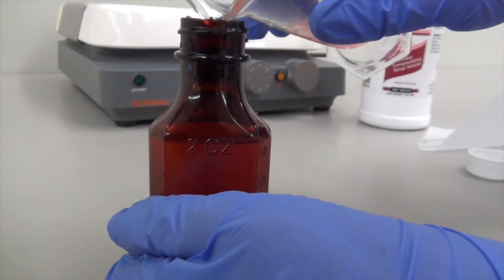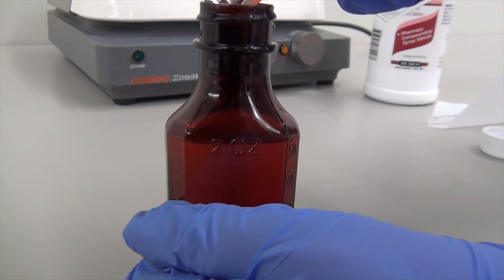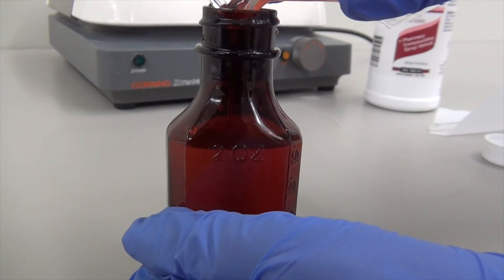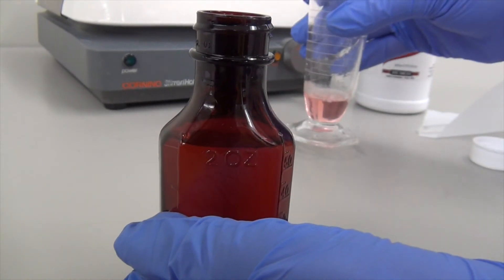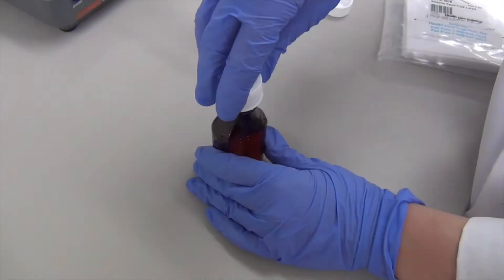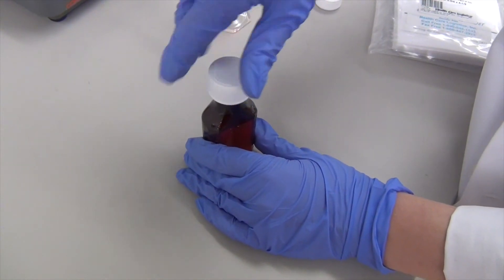QS your final solution using the cherry syrup. Make sure you fill the bottle up to the calibration mark. Cap your bottle and swirl it gently.